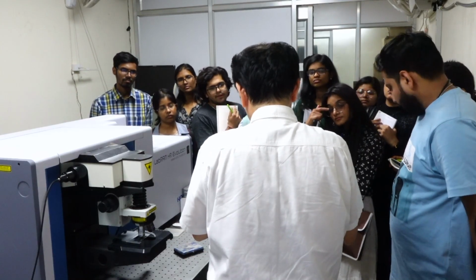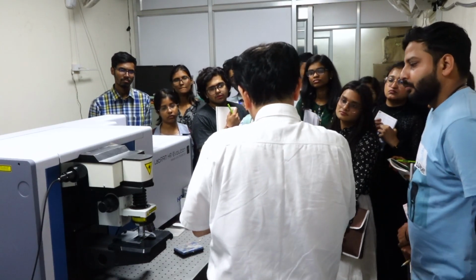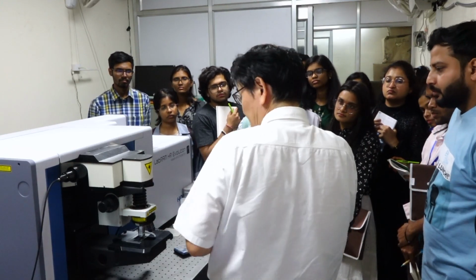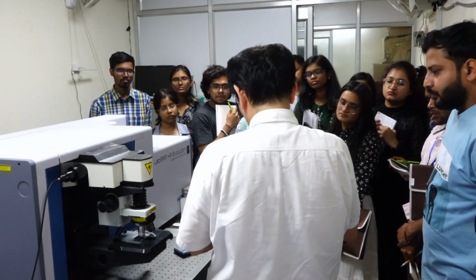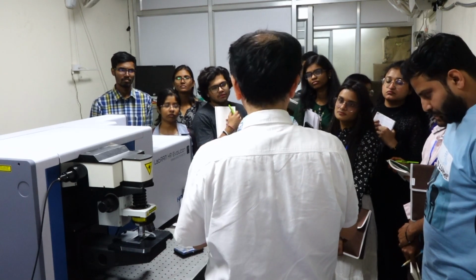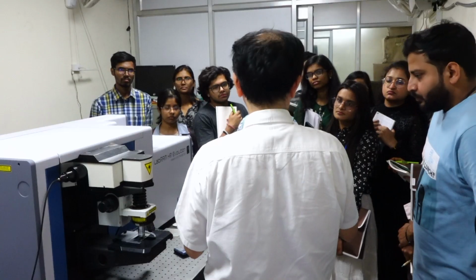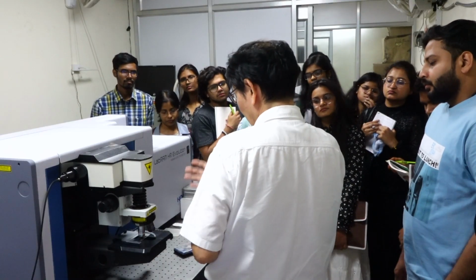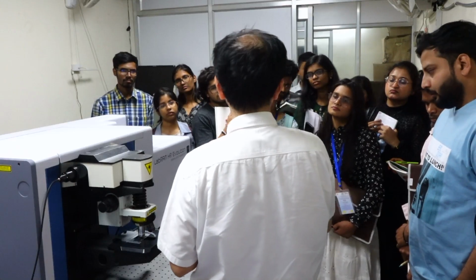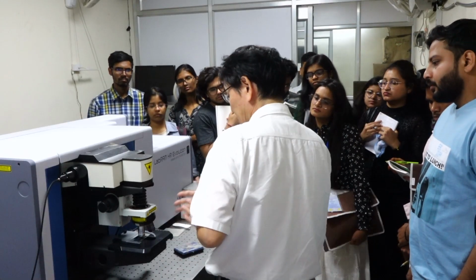So it is convenient to compare two points nearby. If we use a larger spot, then we can illuminate a larger area, and probably we get a stronger signal. So we should choose the objective lens for our purpose. Each lens has an advantage.